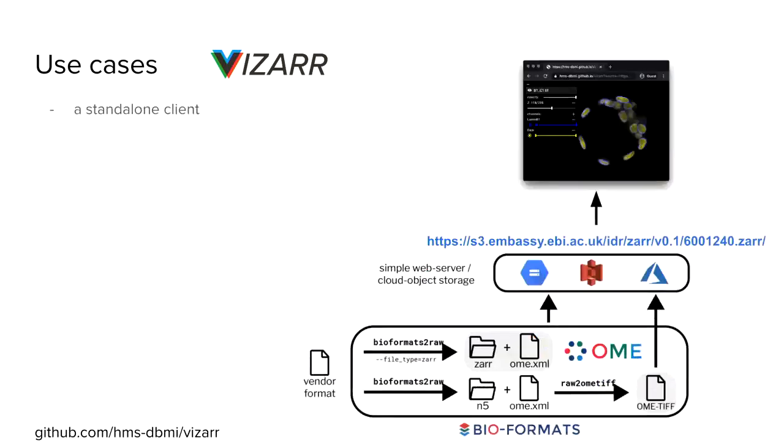Vizar also doubles as a standalone image client. So for any one of these formats, you can point to the simple cloud storage and then give that URL directly to Vizar, and it'll render it directly within your web browser.